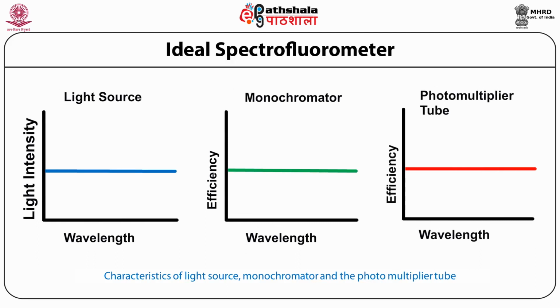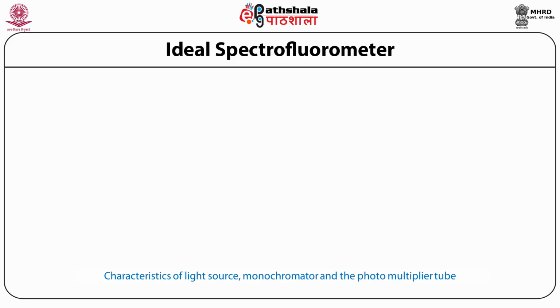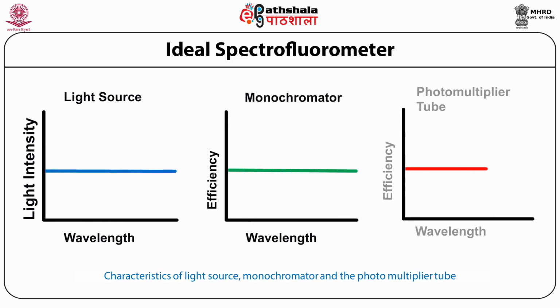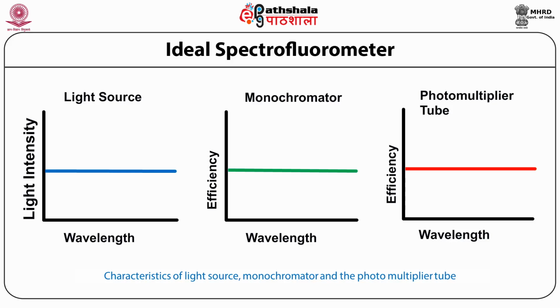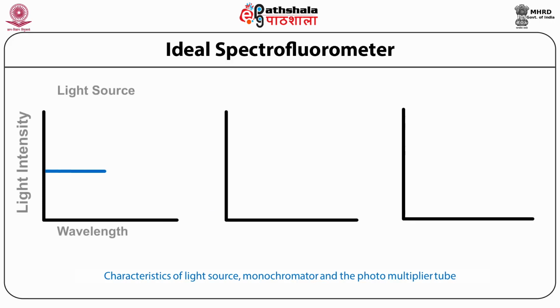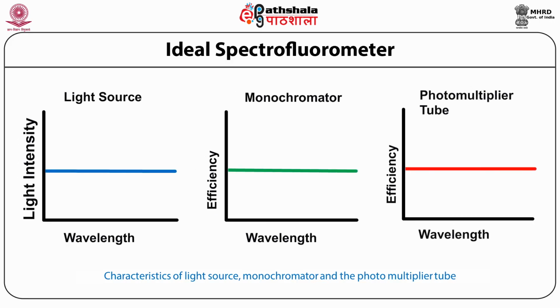The characteristics of an ideal spectrofluorometer can be illustrated in the following figure. Although it is not possible to obtain such ideal characteristics, one is forced to compromise with these components. The above properties are summarized in the following figure.